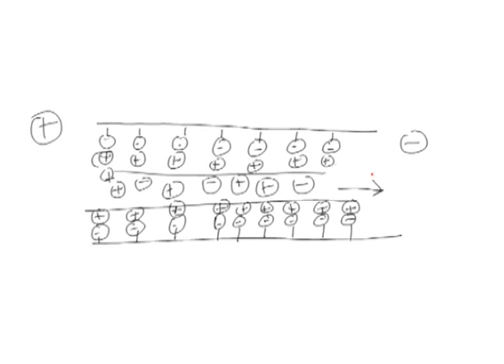Now, essentially what should happen? The positively charged ions should move towards the negatively charged electrode, and negatively charged ions should move towards the positively charged electrode. But because of this formation of the double layer and their interactions, the whole electrolytic flow occurs towards the cathode, and this flow carries everything with it towards the cathode.